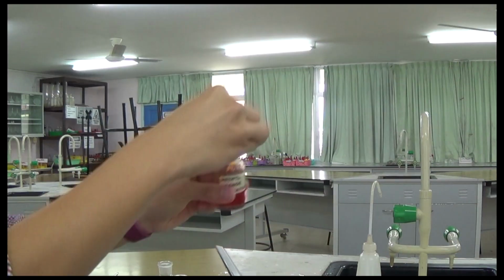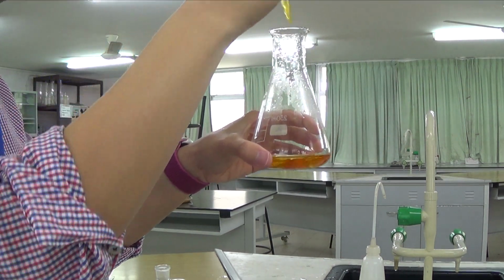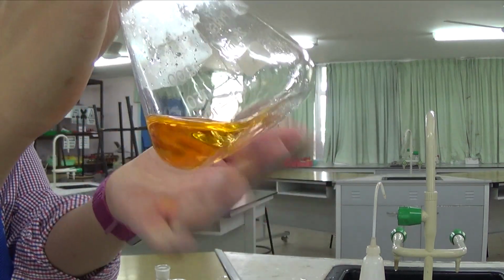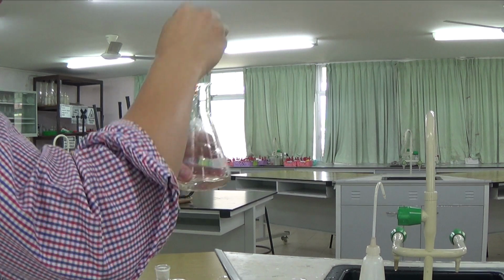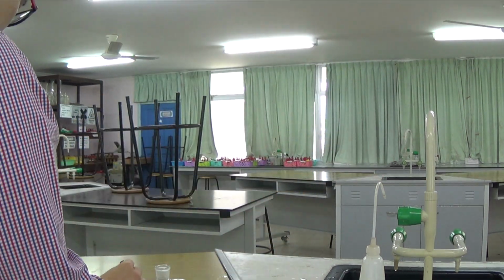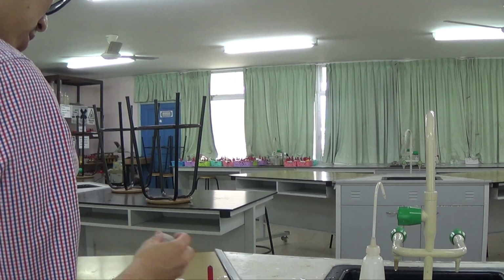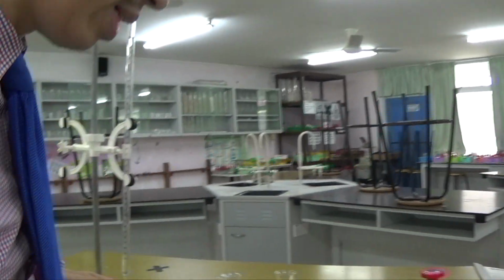Alright? Some students asked, how come you can't see any color change? Because you haven't added any indicator. When you're doing an acid-base titration, it's colorless. This is yellow because this is sodium hydroxide. Methyl orange is yellow when it is in base, when it is in sodium hydroxide or any kind of hydroxide. It's going to go orange when you reach the end point. It's going to go pink or kind of reddish when it is in excess acid.